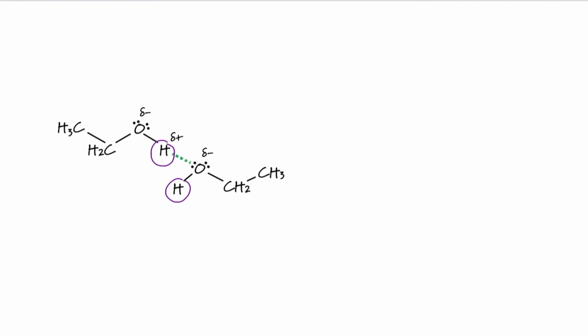And the reason is because these molecules are capable of hydrogen bonding, either between themselves or between themselves and a polar solvent. And this affects the electron density around the proton. Not only have we got electron density being withdrawn because it's being pulled towards the oxygen or the nitrogen atom they're actually bonded to, it's also being pulled away as a result of the hydrogen bond.